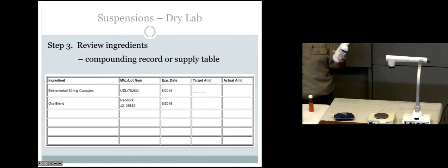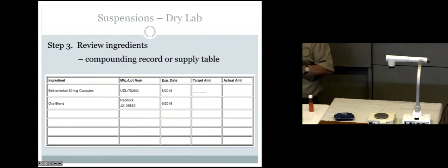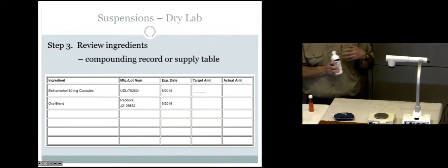Has anyone ever tasted it? It tastes blah. And it's not like terrible, but it's blah. You'll see this is white, milky, blah. It doesn't taste very good. So, that's not very good. So, what does the manufacturer say to use their product? And again, this is a little bit in the podcast. To use a commercial suspending agent and flavoring vehicles, they're mixed in a manufacturer recommended ratio of what?